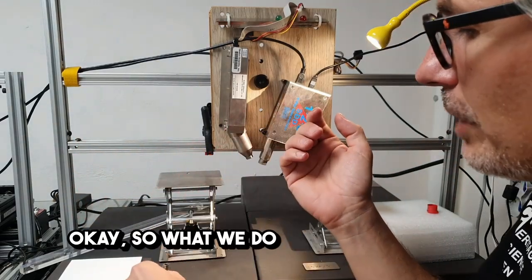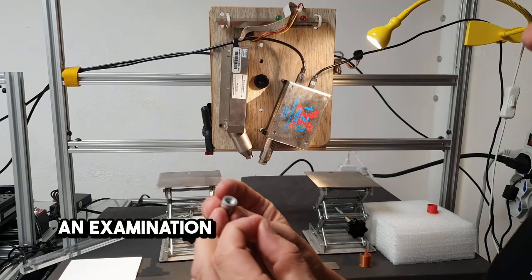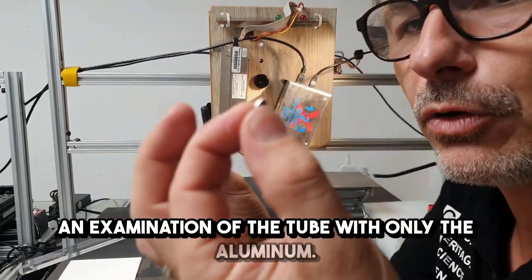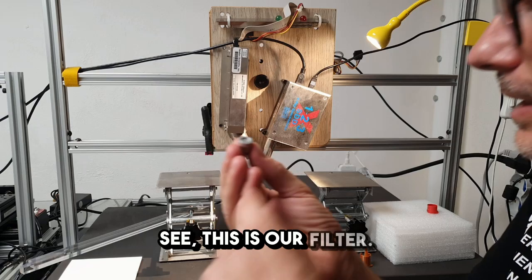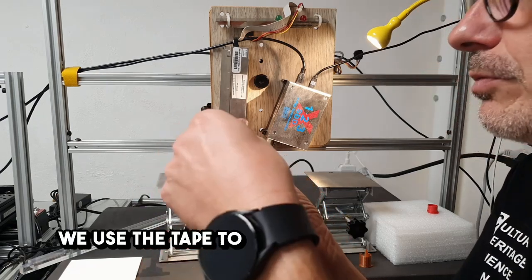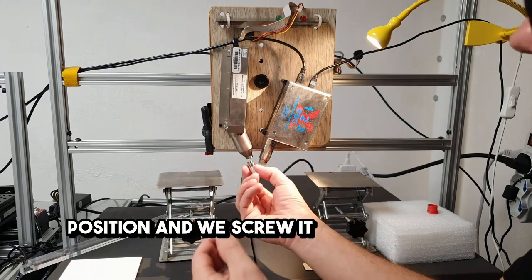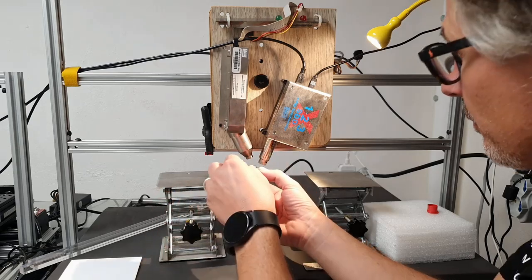Okay, so what we do now is first we do an examination of the tube with only the aluminum. So we put the aluminum over here. See, this is our filter. We use the tape to bring it in this vertical position, and we screw it back inside the tube. So just aluminum.